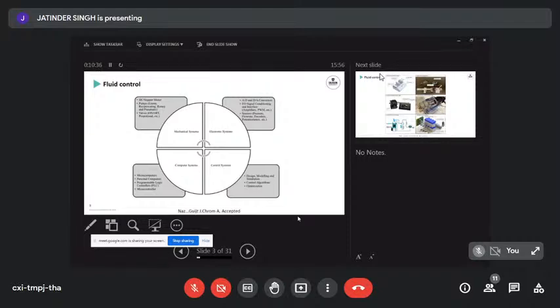If we've got a photo detector in there, we need an analog to digital or digital to analog converter talking with that. We may need some amplifiers to amplify the signal already close to the electrodes. We may want to know what our flow rate is, so we may want pressure sensors, flow sensors in there. Could be a potentiometer. So we've got some mechanical systems to get the flow working, and some electronic systems that need to work as well.